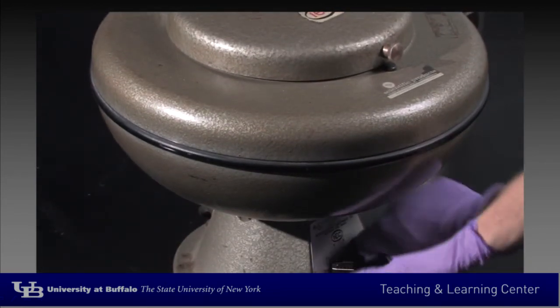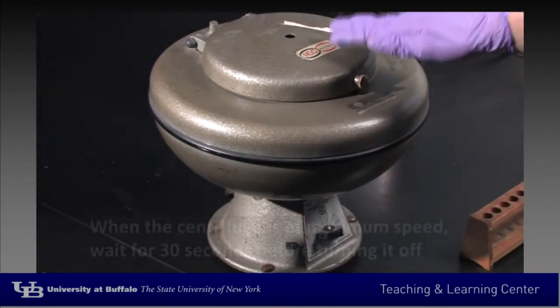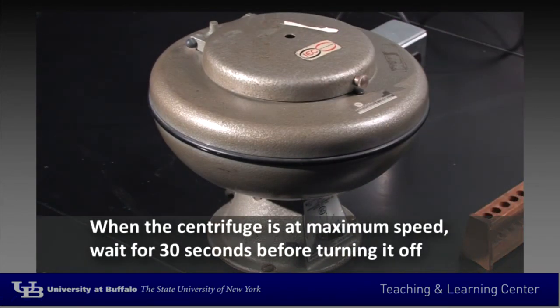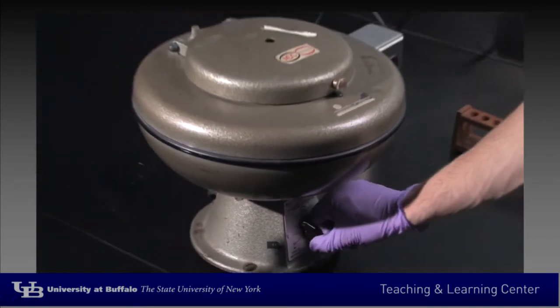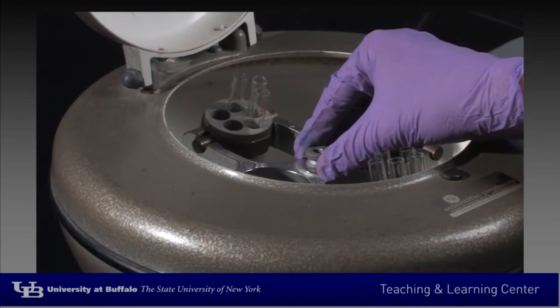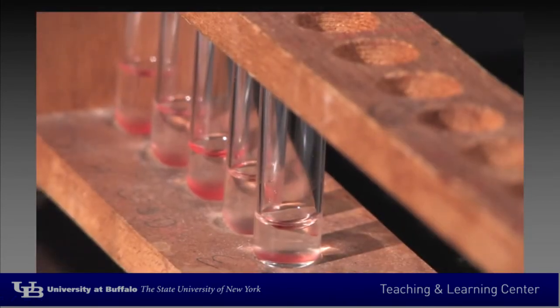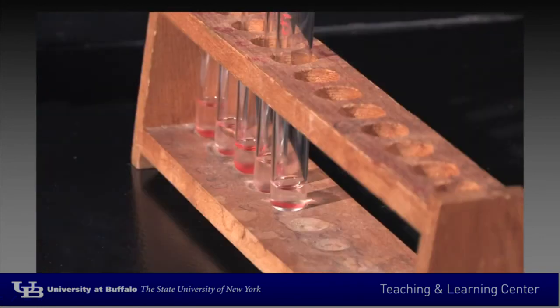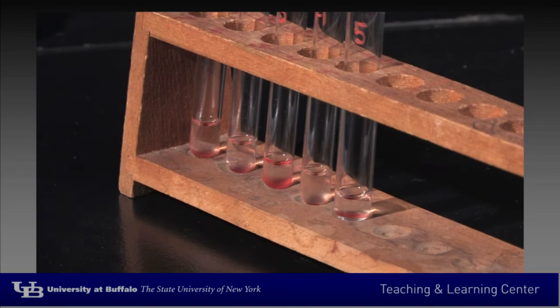Slide the lever on the centrifuge from the off to the on position. When the centrifuge reaches its maximum speed, wait about 30 seconds and then push the lever to the off position. When the carriers have stopped rotating, remove the tubes and place them in your test tube rack. You can see that after centrifugation, the cells are pelleted to the bottom of the tube.